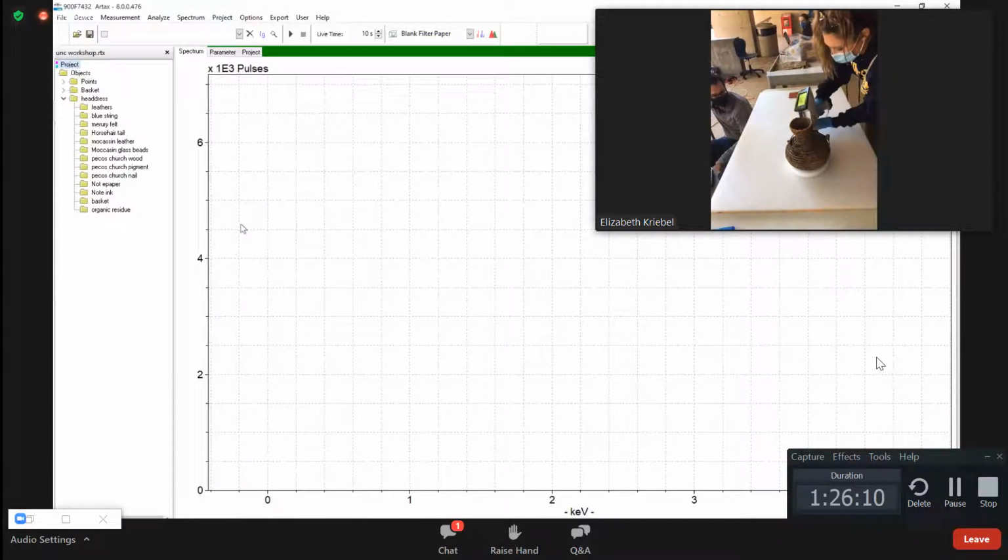Strap. Yep, whatever's most comfortable. Take a minute to look where the measurement's going to take place; the little oval, you want to make sure that's on the leather. A little harder now that we're testing this smaller object. Testing really saps your energy. All right, ready?